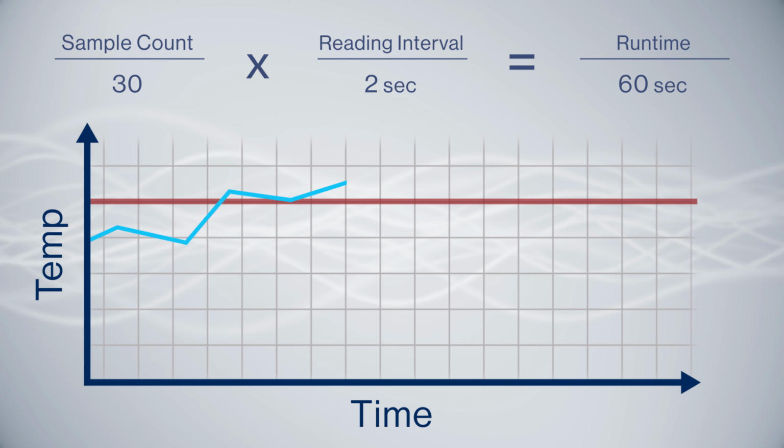Here the trigger settings can be configured to allow a device to automatically start and stop recording data when certain reading thresholds are reached using two different modes. In window mode, a user can set a high trigger, low trigger, or both, and if either threshold is breached, the data logger will begin recording. The number of readings the device writes to memory once triggered will be determined by the number entered in the fill memory on first trigger option.